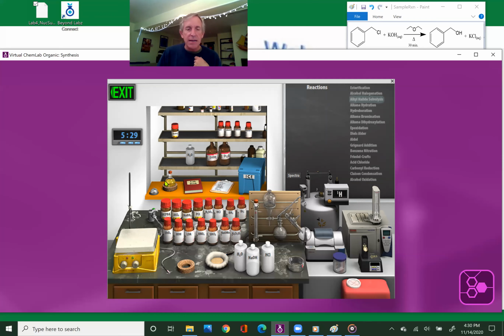And you can see that when you put the cursor over at this point, it is telling you what you have. And so please make sure that the blackboard shows exactly what you want in the flask at this point. Now again, just click and grab the flask, put it over in the ring stand, and I'm ready to add my aqueous KOH. Where is that aqueous KOH? It's down there somewhere. So you can just go over it.